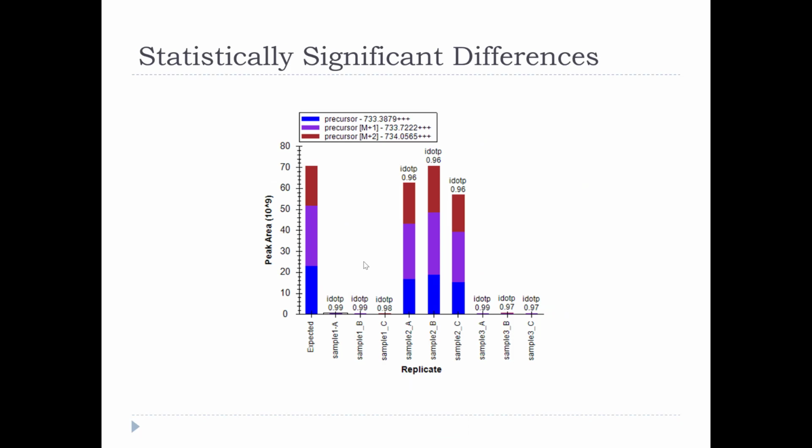Okay, so here's another one. Who thinks that there's a statistically significant difference? Got one person. Okay, come on, this is even more extreme. This is like 10 to the -9. So wow, any statistical tool is going to go, that is so interesting, this is a biomarker for sure.